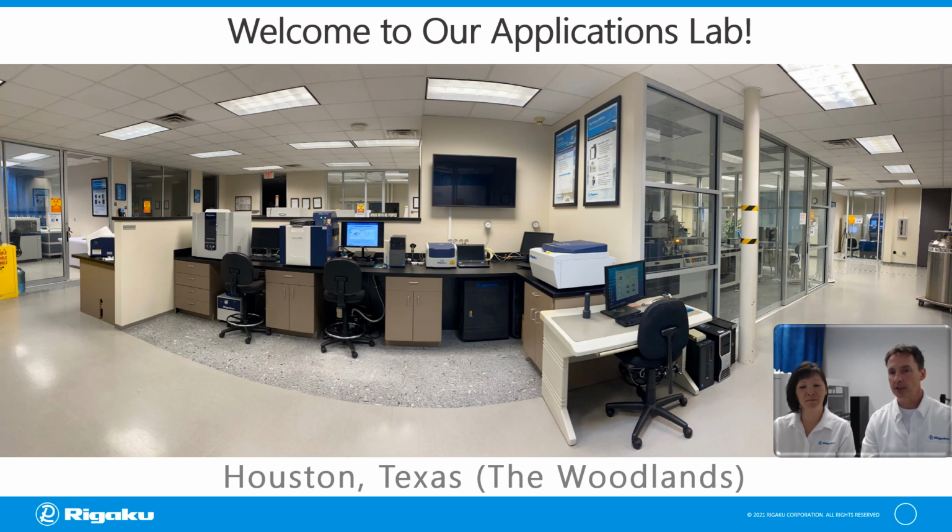We're in The Woodlands, Texas, just north of Houston, and this is just a picture of our applications lab. We're going to be working from one of these Primus 4 or 4i bays. We're actually in another one where we'd be looking at that picture as it is right there.